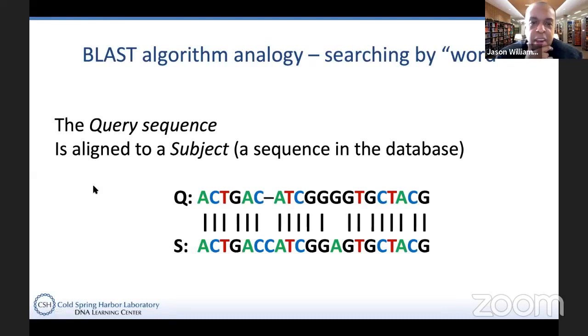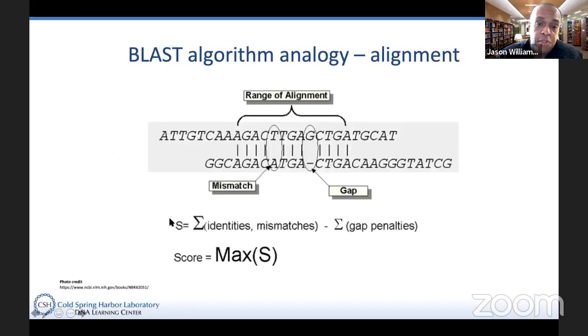What happens in the BLAST algorithm is that it's matching up your query sequence to the search sequences in the database. And sometimes they'll be perfect matches and sometimes they won't be. Anytime we have this bar between them, that's a perfectly aligned match, but maybe there's a mutation in one of them, or maybe there's an addition. So it scores those matches, and it uses a formula basically saying that you should penalize the match if it's not a perfect match. And you can, to a greater or lesser extent, determine what your penalties are for having a mismatch or for having a gap.